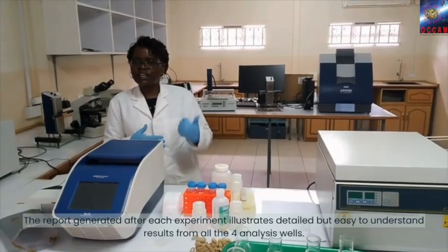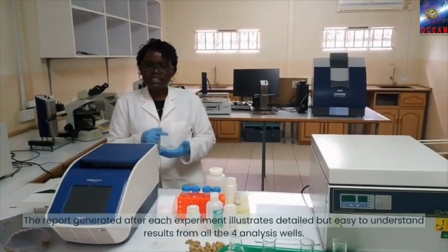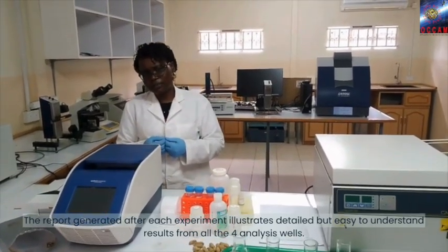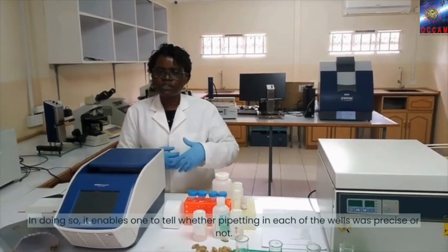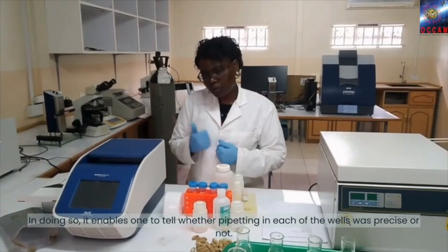Reports generated after each experiment illustrate detailed but easy to understand results from all the 4 analysis wells. In doing so, it enables one to tell whether pipetting in each of the wells was precise or not.